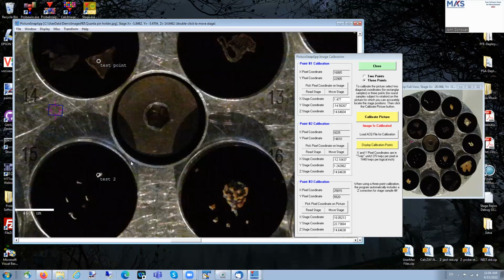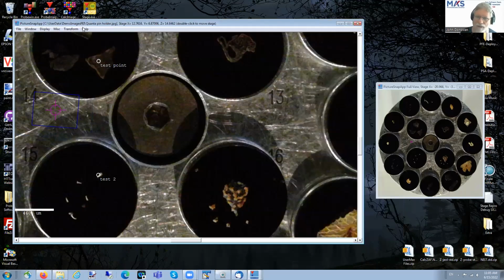In the demonstration and the text input mode, you have to use the up or down arrow keys, your cursor keys, and you can change the size of the image, and then you hold the shift key down, and you can make a smaller change. And when you're at where you think you want to be, I'll close this up here, you can actually define a field of view.